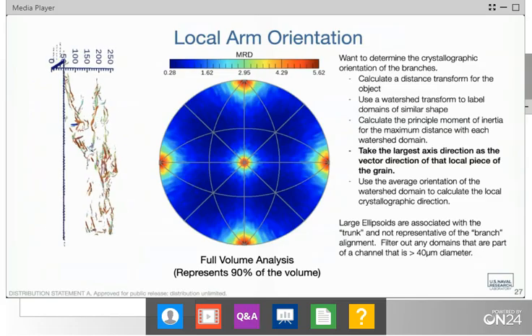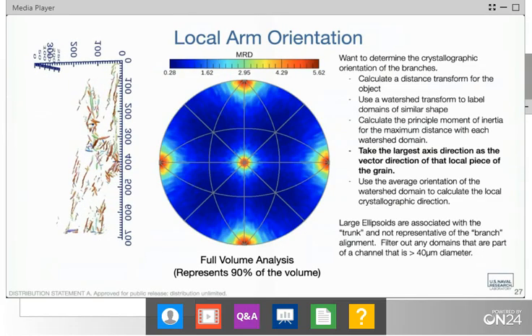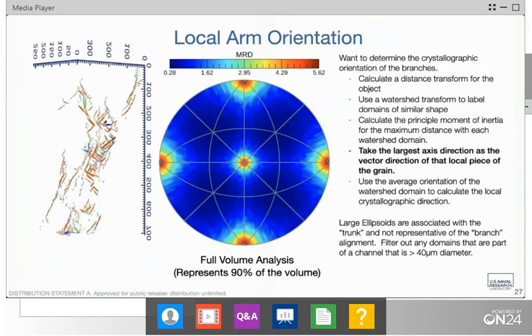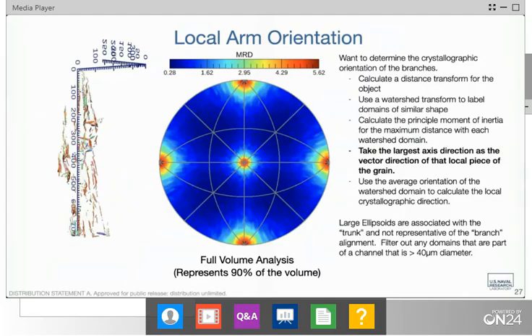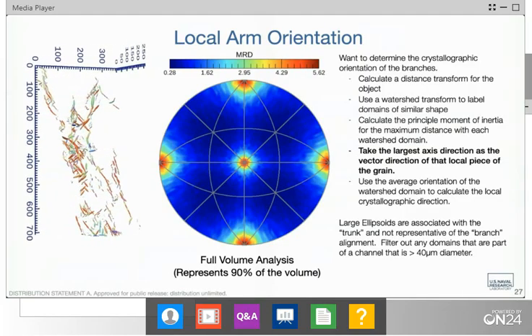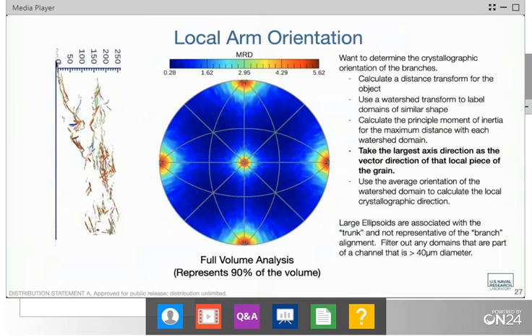We actually have something that will notify us on our mobile phones that if the machine gets confused, please come check on me. We can often just dial in remotely and maybe solve the problem. Sometimes we have to be there in person, but that is kind of the thing. And there are a lot of checks to make sure that everything is working properly. We do independent checks to make sure that the EBSD camera is inserted properly and retracted properly.